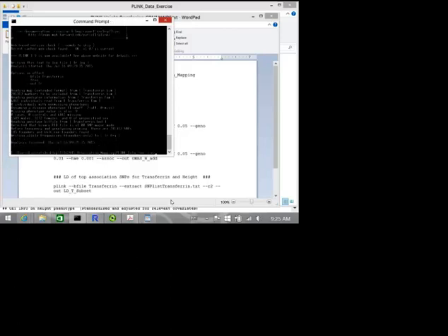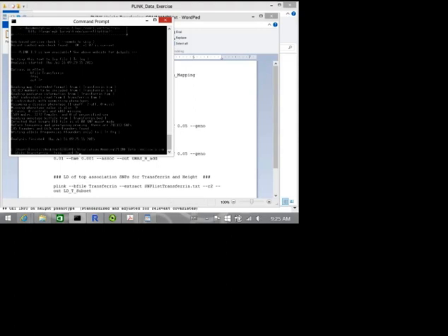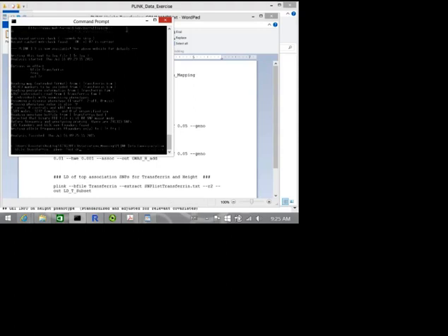The output when I do the frequency is tr.freq, and you can open it in a text editor, or in this case, since I'm using a Windows machine, I can use the more command, more tr.freq.